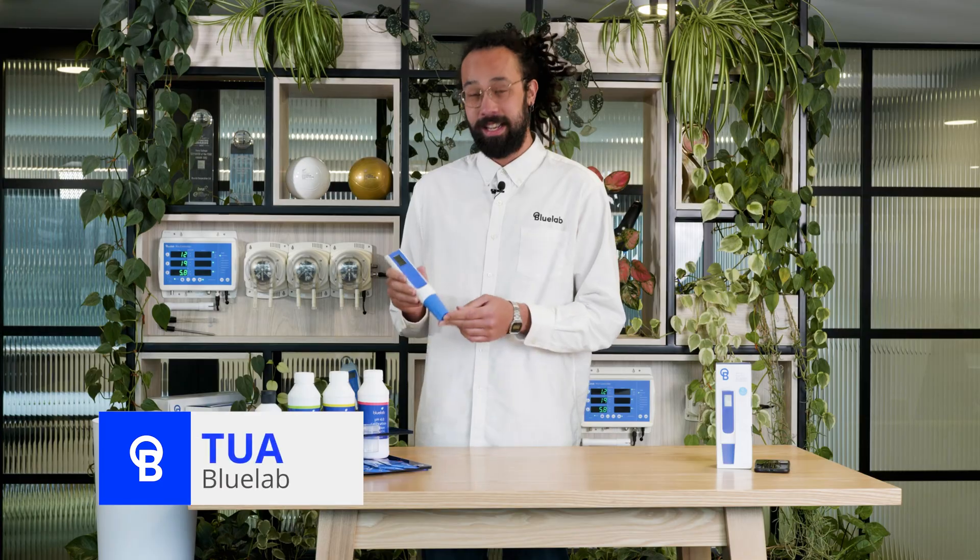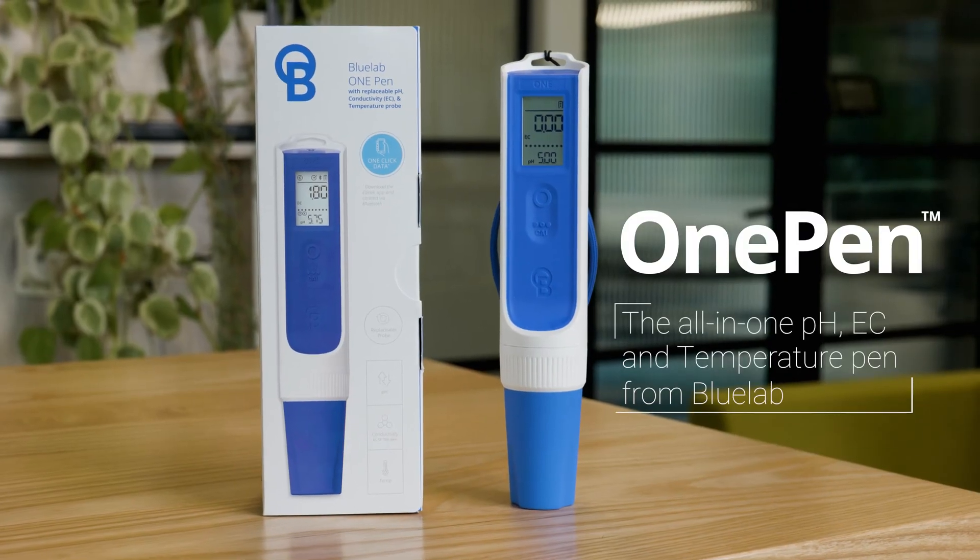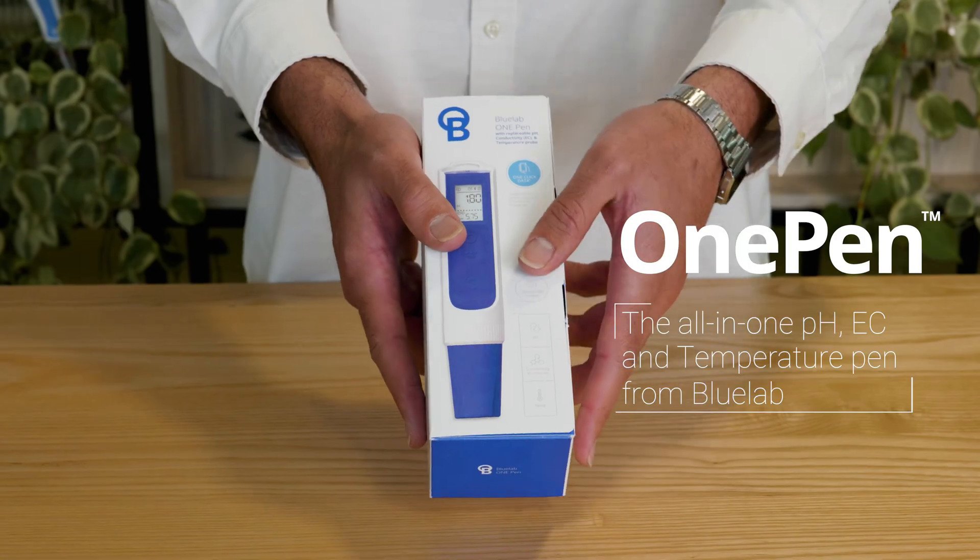Hi, I'm Tua from Bluelab and today I'm introducing our latest product, the Bluelab One Pen. All-in-one pH, conductivity and temperature with a replaceable probe.